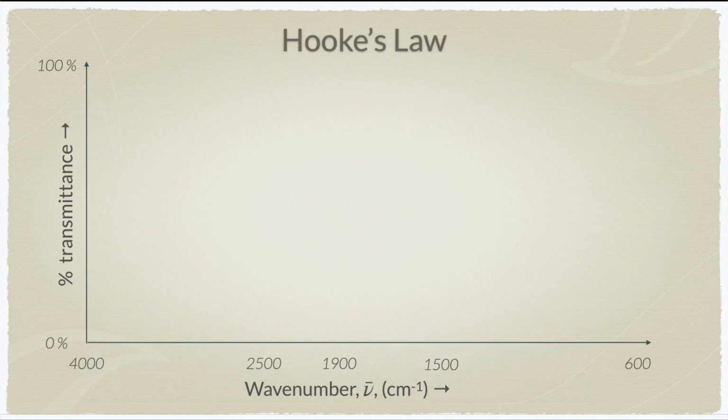Now I'll not go into the detail of Hooke's law, but Hooke's law is usually applied on objects that are attached to a spring. Because we consider the covalent bond to be a spring in nature, and then you have atoms at the two different ends, you can also think of it in that way. So now let's first have a look at the spectra. So this is a particular spectra.